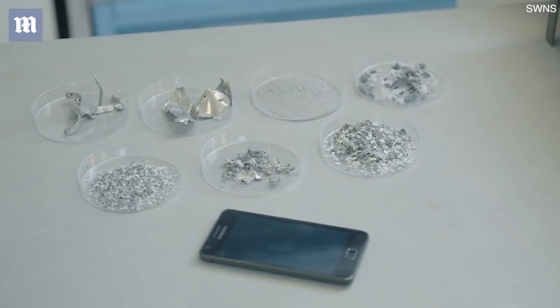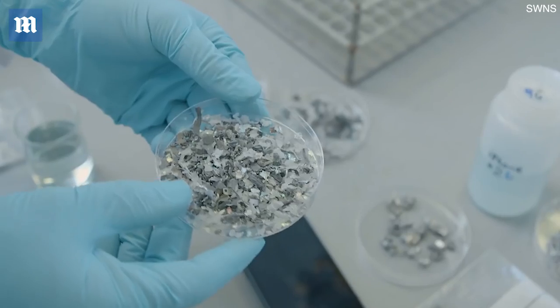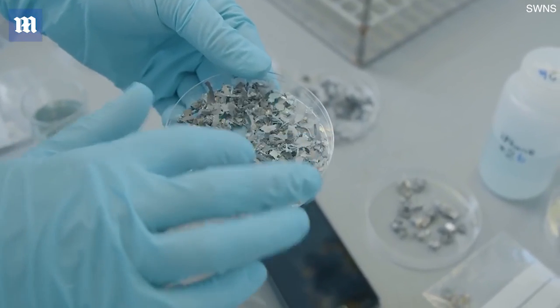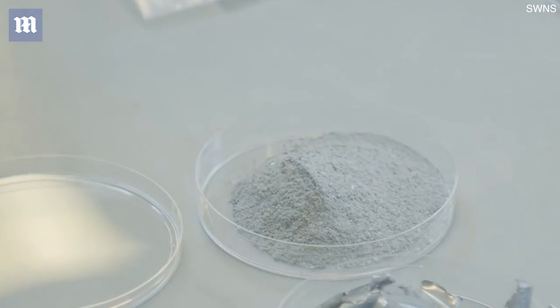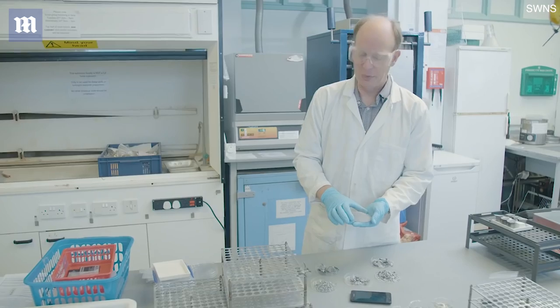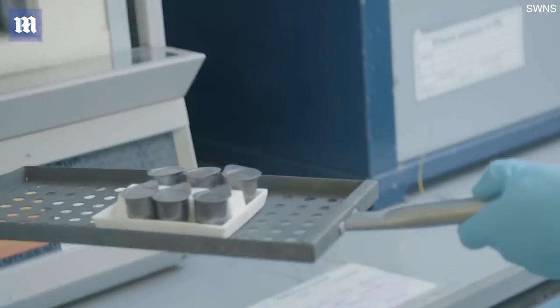This is our phone. This is what we got when we put that in the blender, and I separated it into different fractions. There's some coarse bits here, some of the bits of plastic here. What we're interested in here today is actually this powder, the very fine powder, and that's what I've put in the crucibles and in the oven behind me. So let's see what we've got.